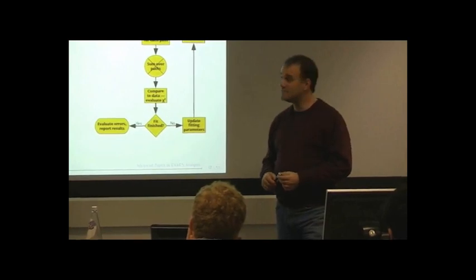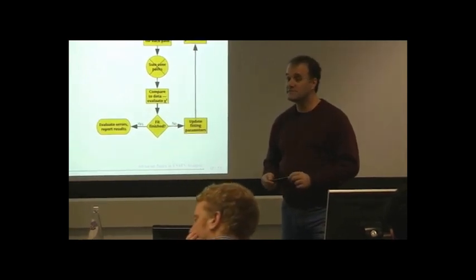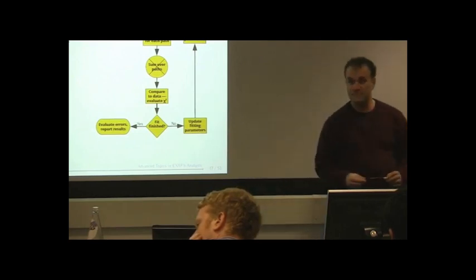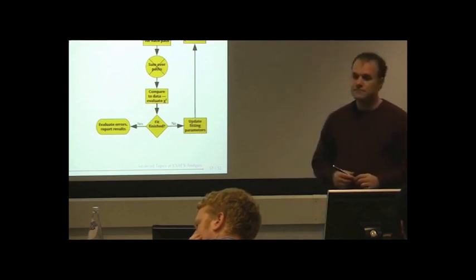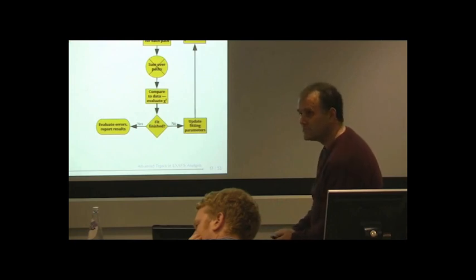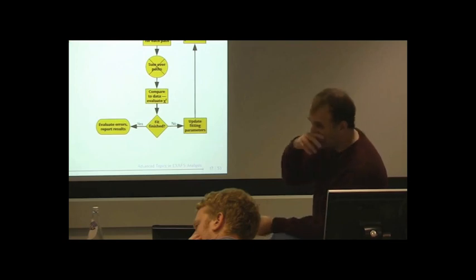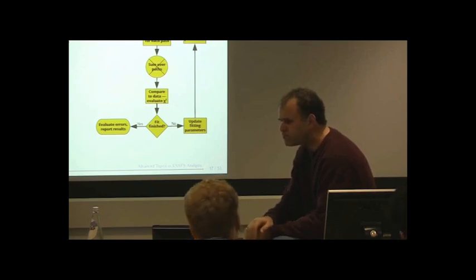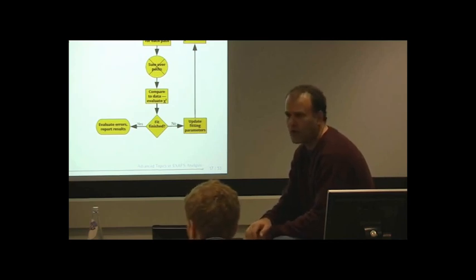Yes? So say I'm going through my fit and I've defined a variable for all the parameters, s0 squared. I've got to a point where I need more variables. It seems s0 squared is staying roughly the same for each improvement that I do. Can I then fix that and continue on with the statistics, and they remain good? Well, the answer is either sure, of course, or certainly not, no way.